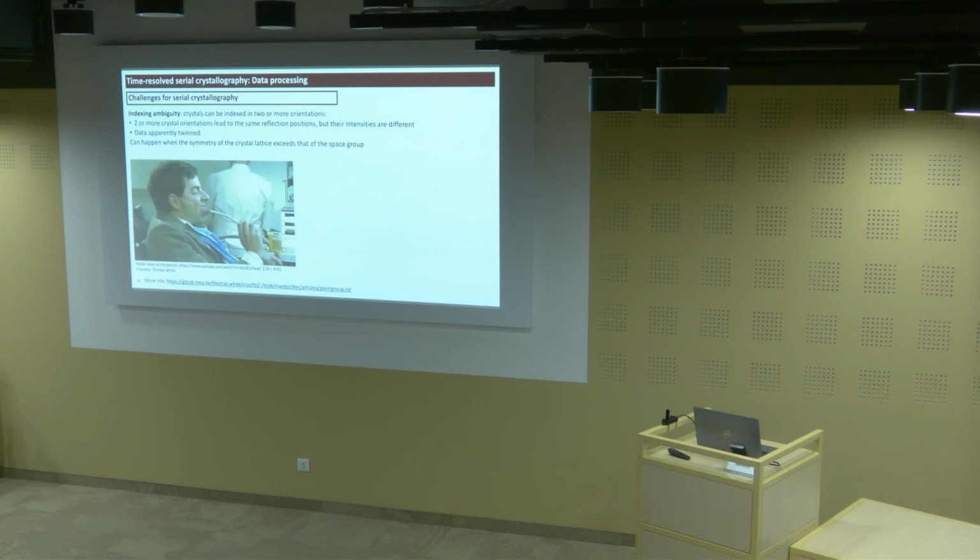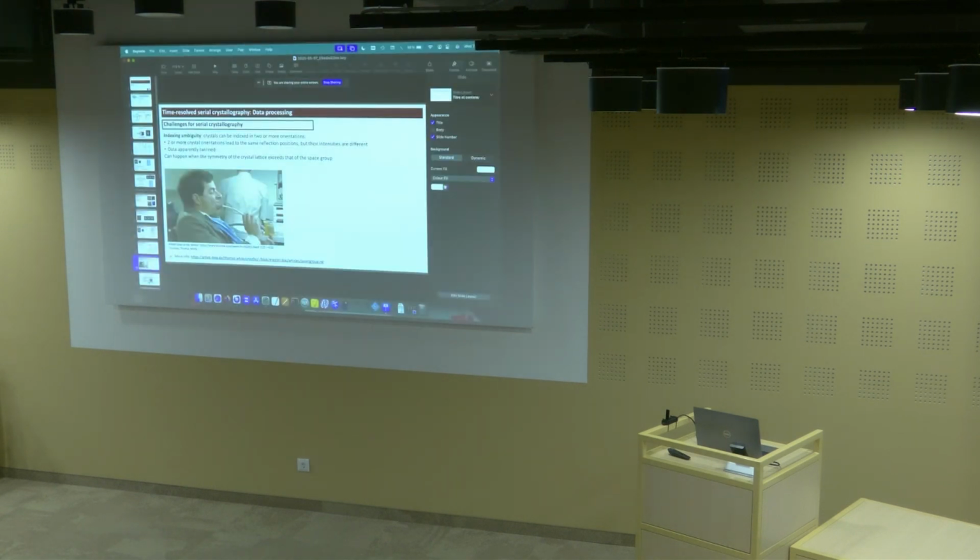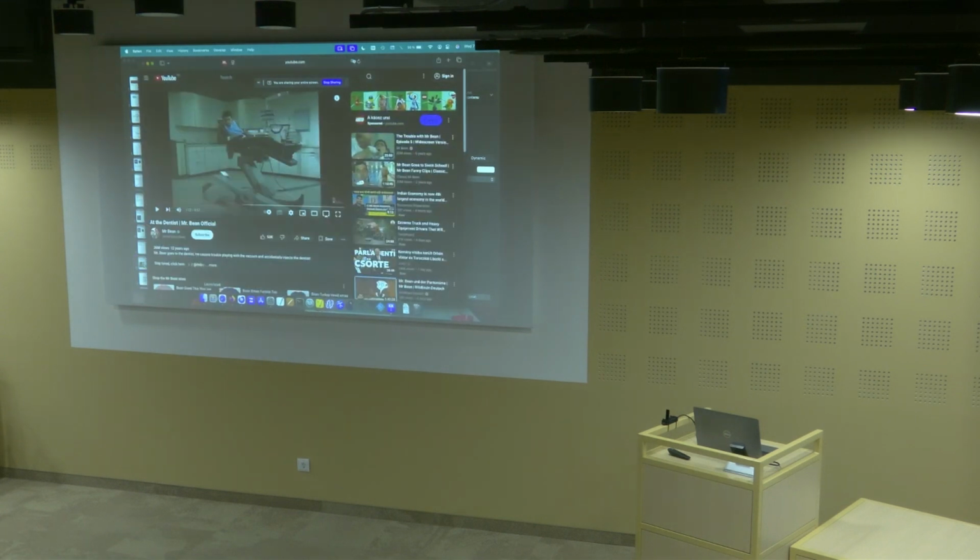So to illustrate what indexing ambiguity actually means, we're going to look at a little video of Mr. Bean. This was an idea from Thomas White. This is not my idea, but I find it absolutely great. So I hope we will not have any ads.